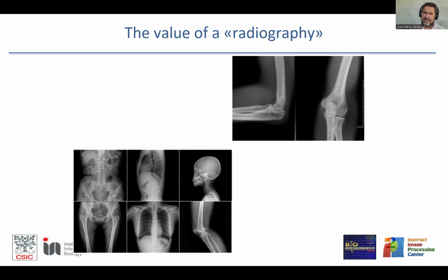And even if the physics involved is completely different, the mathematics involved in many aspects of biomedical imaging with X-rays are very similar to the electron microscopy field. So an image in electron microscopy is exactly the same as an X-ray radiography. It's a projection of the specimen, a human body, along the direction of the beam. And then you see here the lateral of the chest.